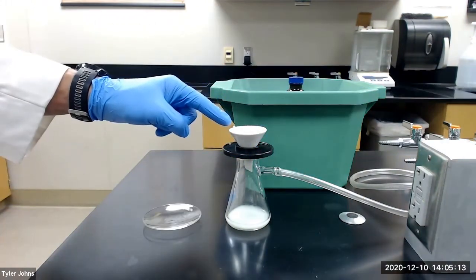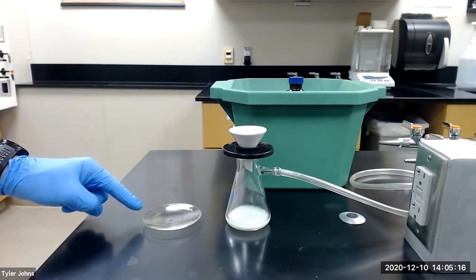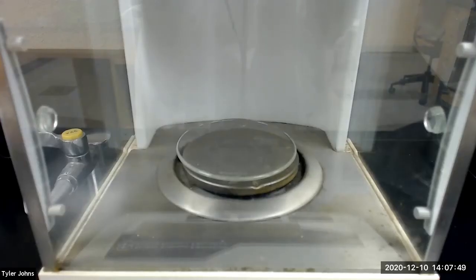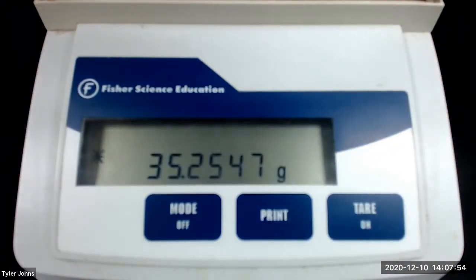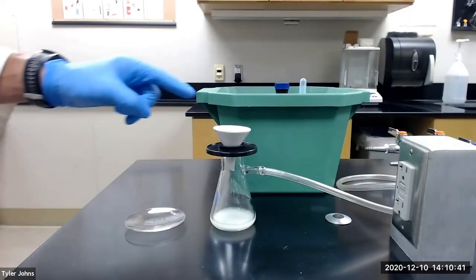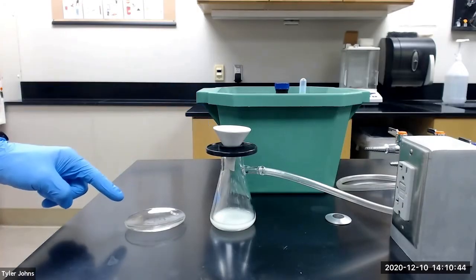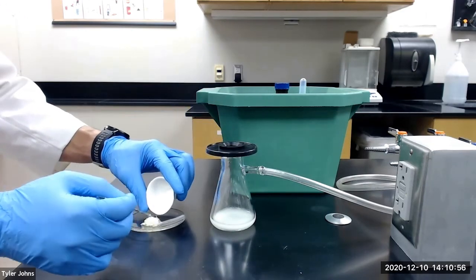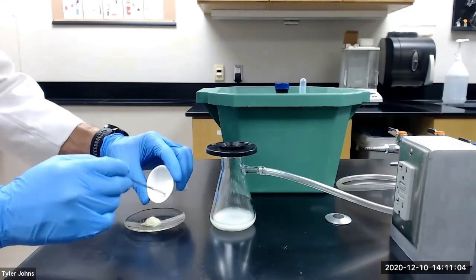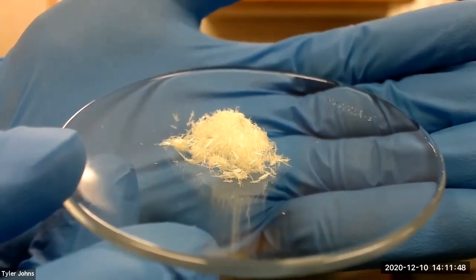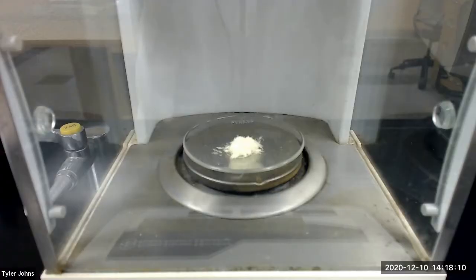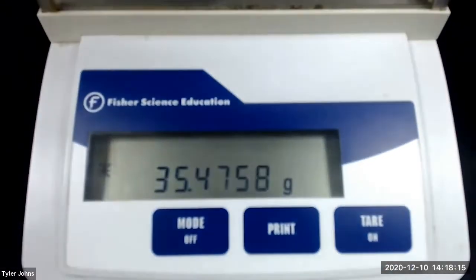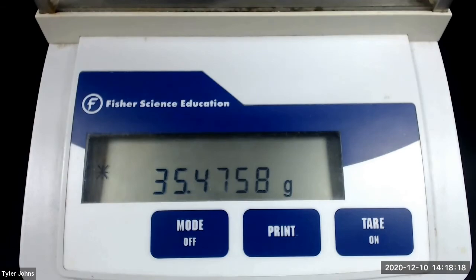While the purified benzil crystals continue to dry, we will next pre-weigh a watch glass. The mass of the pre-weighed watch glass is 35.2547 grams. We will next collect the purified benzil crystals on the pre-weighed watch glass. The mass of the pre-weighed watch glass and the purified benzil crystals is 35.4758 grams.